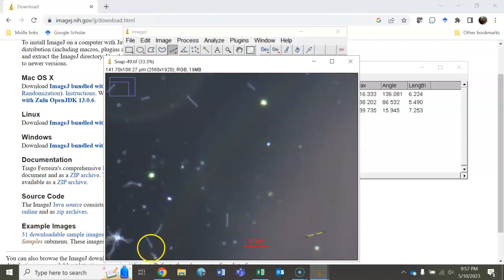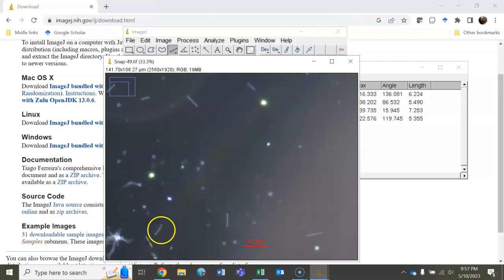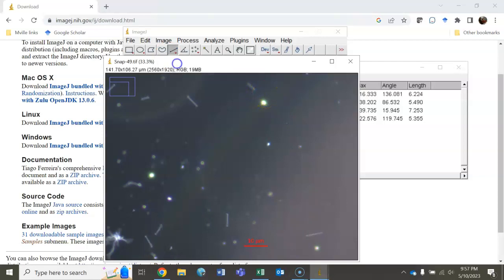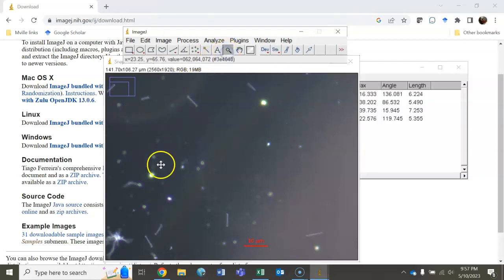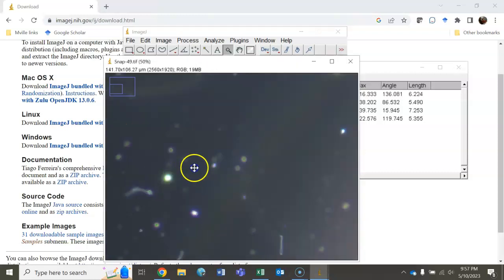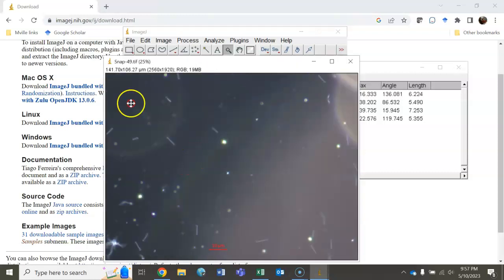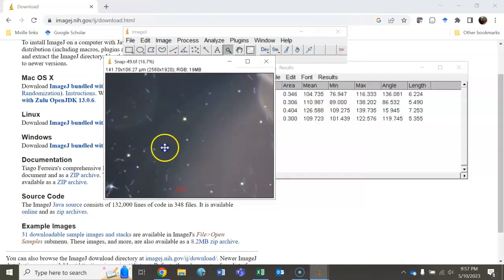You're only going to want to use the spirochetes that are in the plane of focus. For example, up here at the top, this spirochete looks like it's out of the plane of focus, so I'm not going to want to measure that one because it's not going to be correct. This one over here as well, it's out of the plane of focus. Something weird is going on there. You're going to have to go around to the entire image and capture every single cell you see that can be captured.